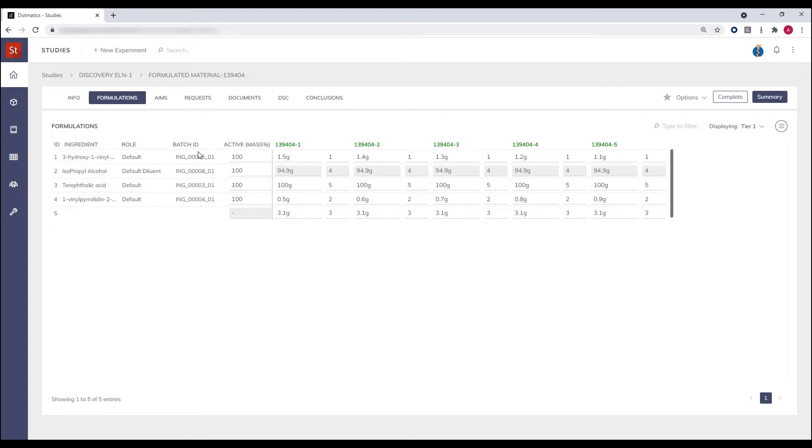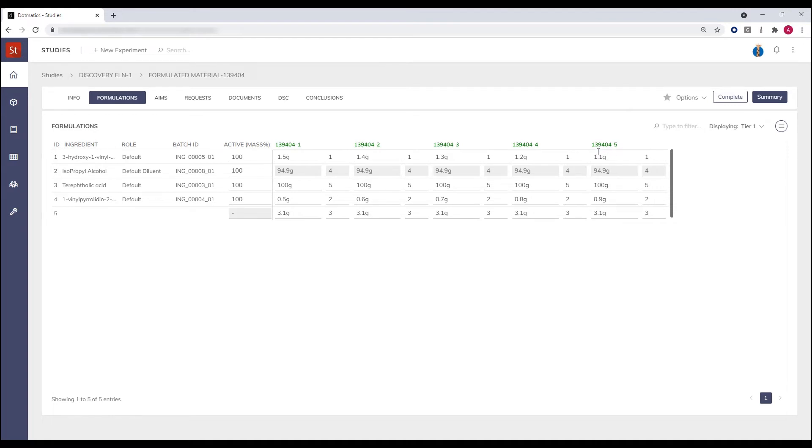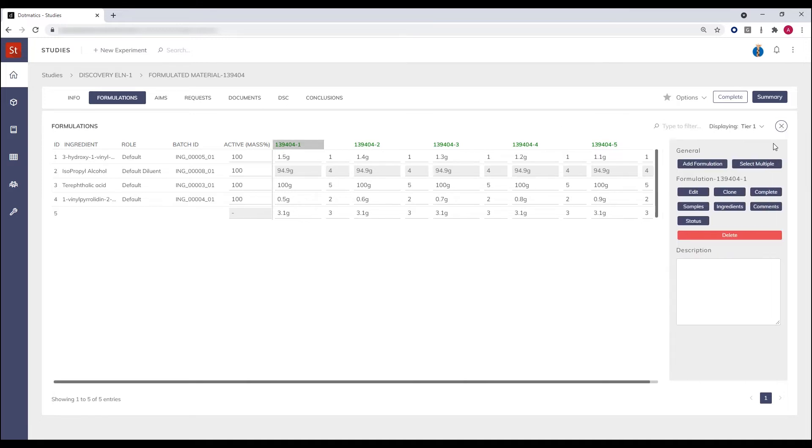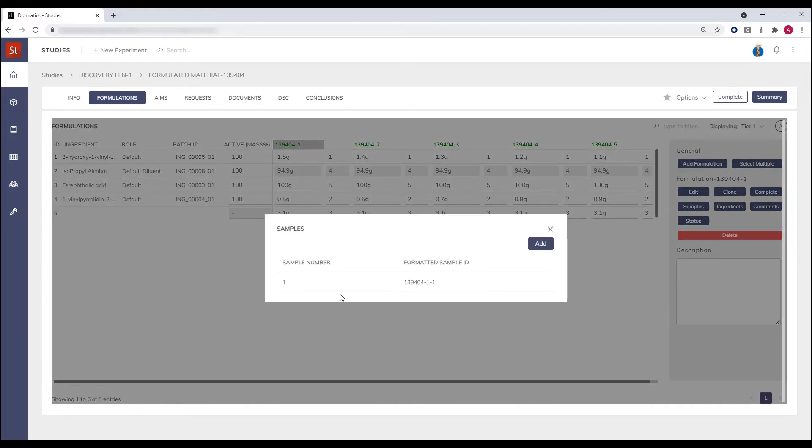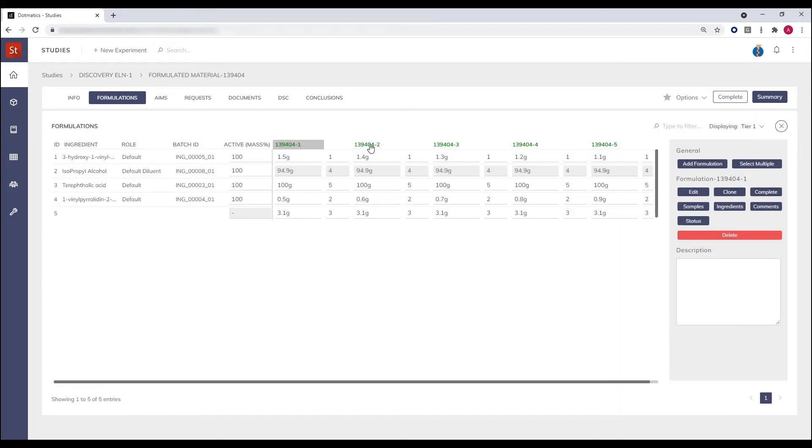In this example, we have five different formulations where the quantity of the vinyl material is being modified. Once the scientist has performed the task, they can also create samples. For example, here selecting sample number one, I can visually see what samples have been created, and I can see that a sample of each of the materials has already been created.